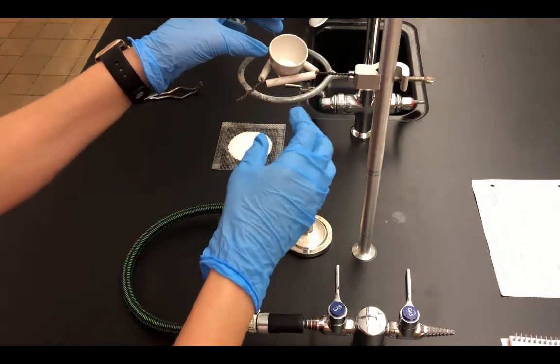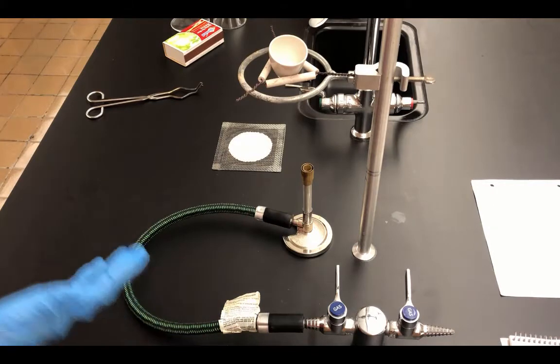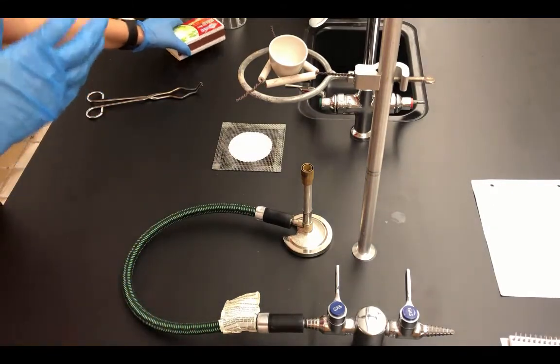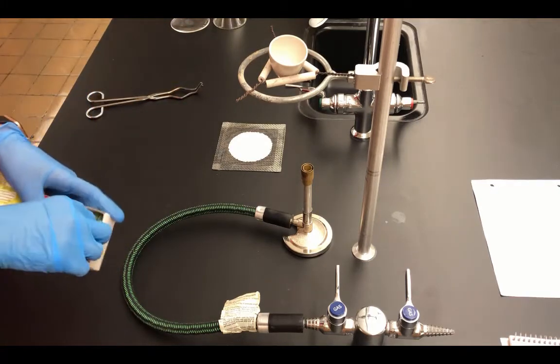Again, you want to try to make sure that it's at a slight angle. I know the picture in the lab shows it laying down, but sometimes with that you want to be careful so that it doesn't roll off. So as long as it is slightly angled, we will be okay.